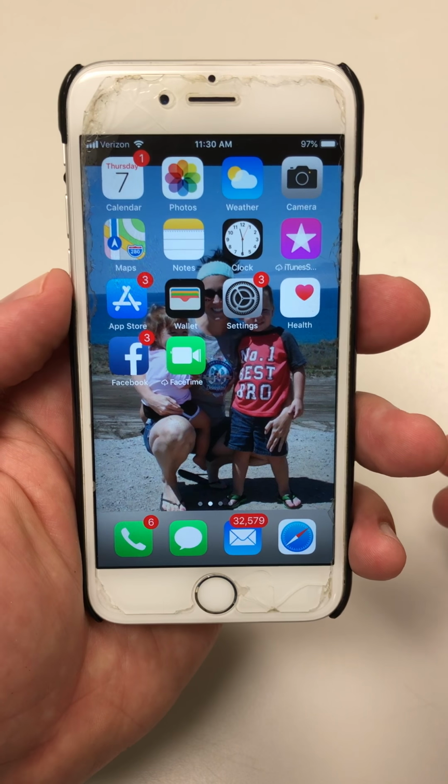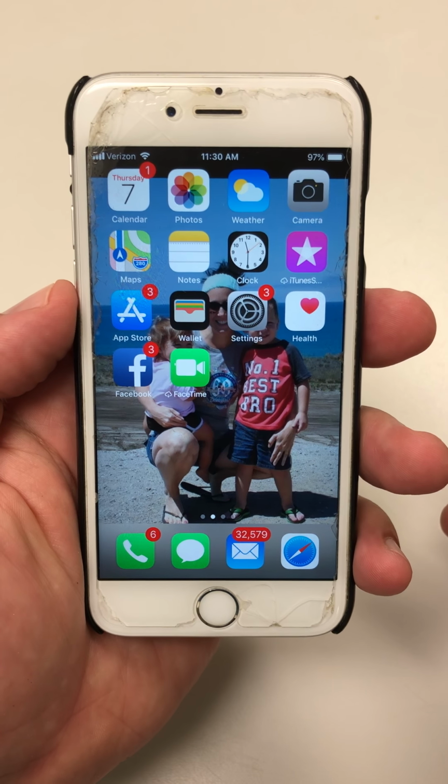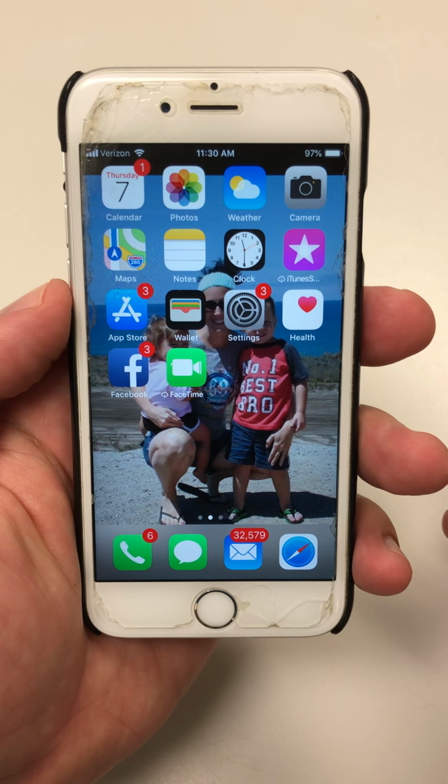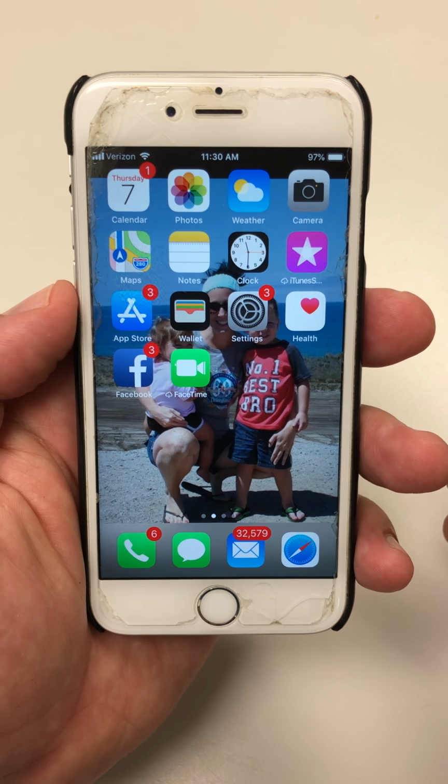So what we're doing here today is we are going to have a walkthrough video of the new enhancements made to the Hanby Environmental Mobile application to complement our field test kits for water and soil analysis.